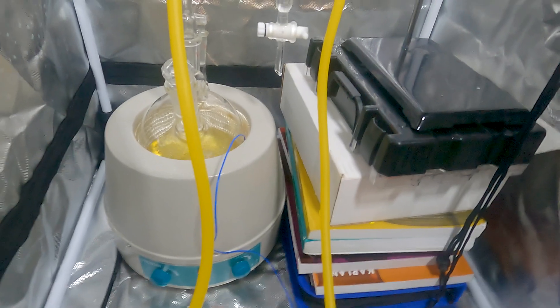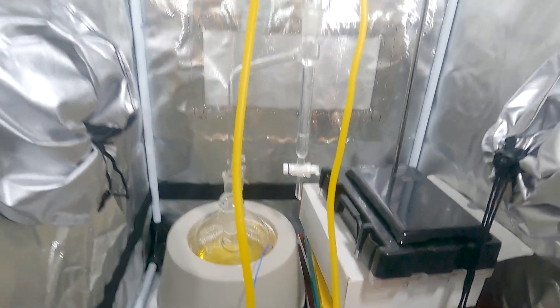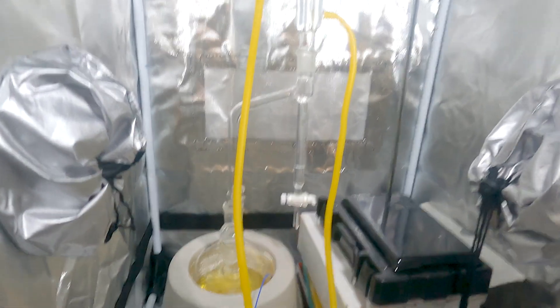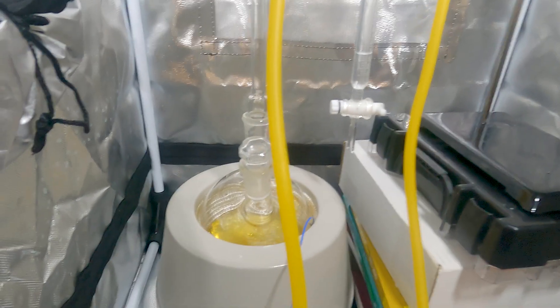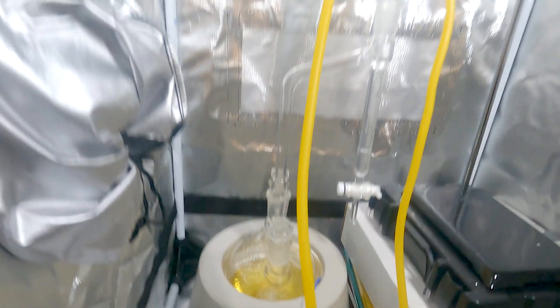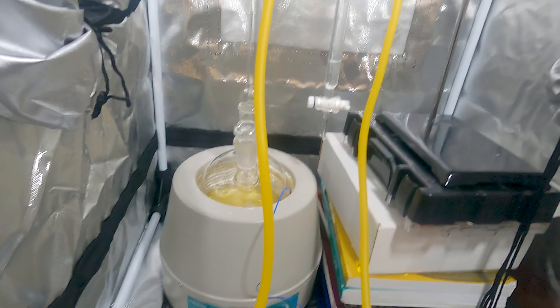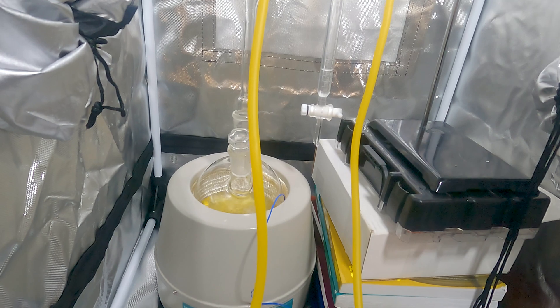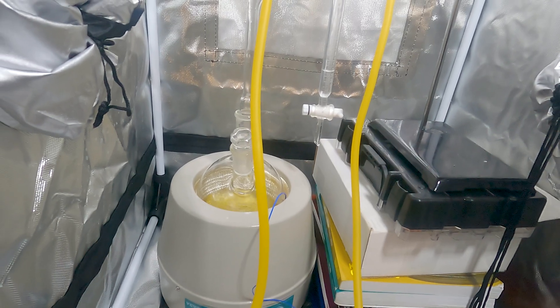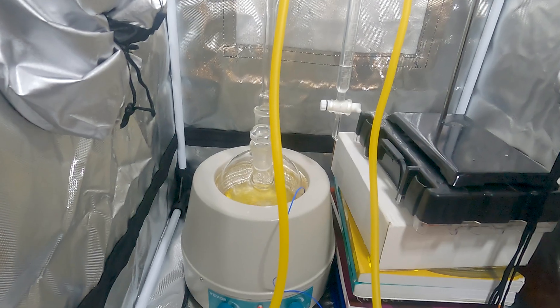I am going to call it here. We are at about 5 hours and we have no more water coming over, so we will go ahead and call it. We have turned the devil's color unfortunately, so hopefully we are not screwed. After this cools down, we will wash it with a little bit of sodium hydroxide and sodium chloride. Let's get started.